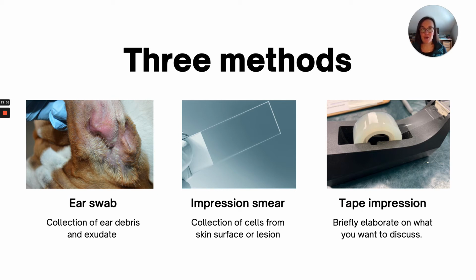And then your tape impression is not going to be as pretty as an impression smear. And we talk about how to know when to do which one. But there's a lot of value in a tape impression, and it is something that I use in certain areas of the body or certain lesions that are present. And we'll talk about kind of how I like to use tape impressions for my cases.